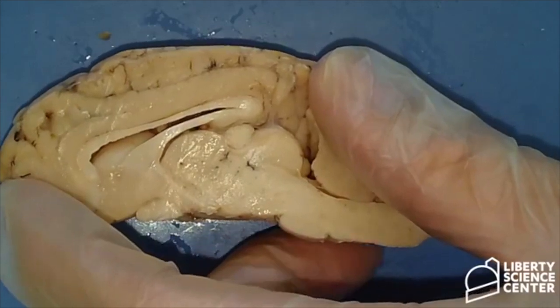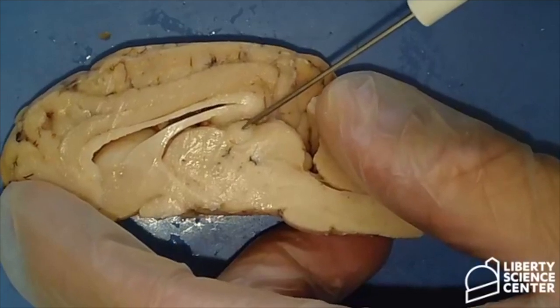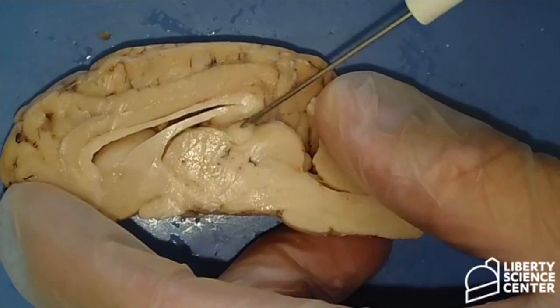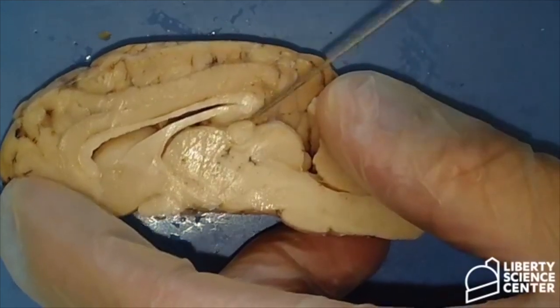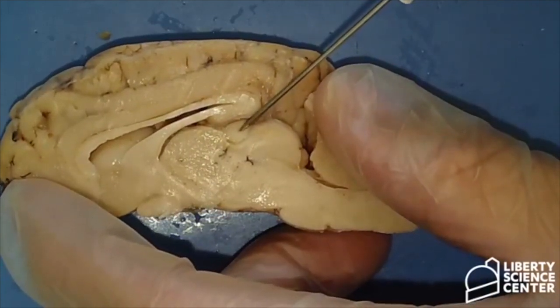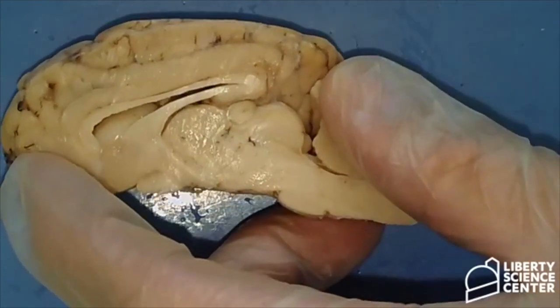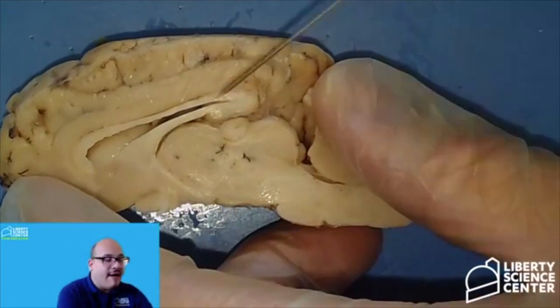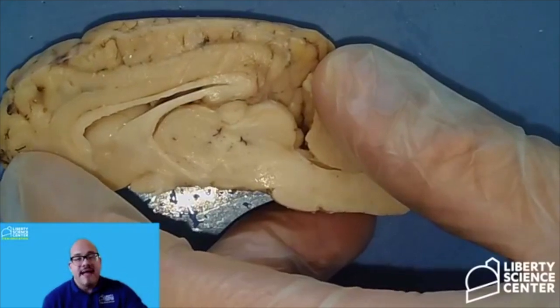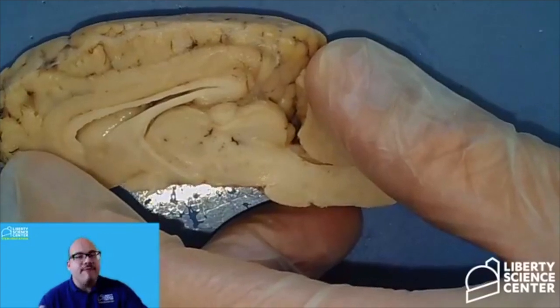All right, the next one. You notice this little structure right here? That's called the pineal body. The pineal body is actually a gland that's found in our brain. It's one of the many glands that we have in our body. The pineal gland helps with what we call our circadian rhythm. So pretty much this structure right here helps us with sleep. It's our internal clock. It determines when we should be awake and active and when it's time for us to go to sleep.